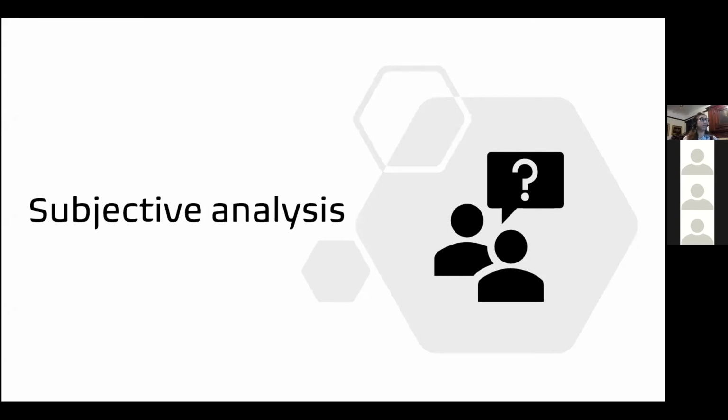And sometimes even deciding between a useless and a normal or abnormal cilia might be a question mark. It might be, okay, is this a cilia good enough for me to analyze? Sometimes it doesn't even have to do with the defect, just thinking, is this cilia a good cilia? So it's quite a subjective analysis. And in all subjective analysis, we need to find a strategy to overcome it.